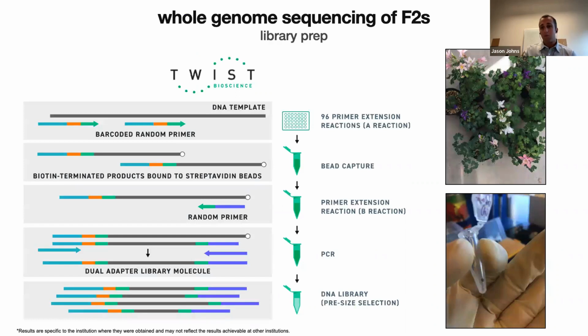And as we probably all know, these approaches are rapidly evolving every year and almost every month at this point. So at this point, thanks to high throughput library prep, high throughput sequencing, and high power computing, doing low coverage or skim sequencing or whatever you want to call it is financially feasible for even relatively low budget projects like mine that are funded by little native plant societies and so on.